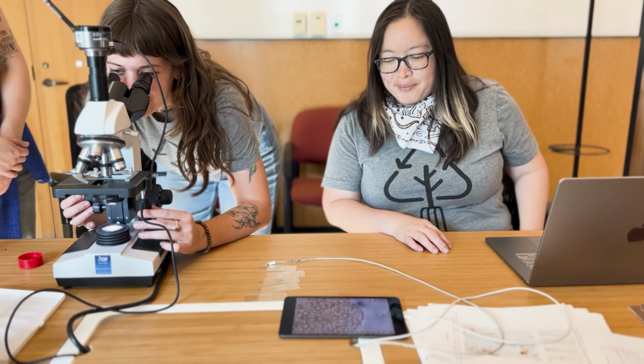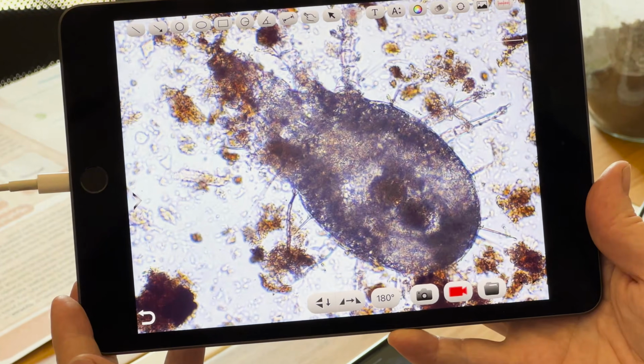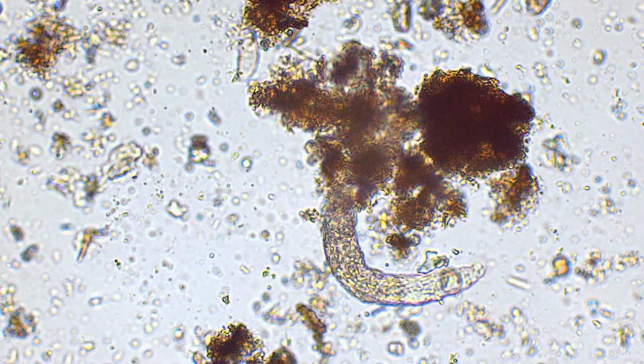LA Compost is a nonprofit that works to provide composting access and education across Los Angeles County. When we aren't composting or collecting food scraps at a local farmer's market, you can often find us at the microscope, educating community members about the benefits of composting and how decomposers influence soil and planet health. In this video, we will provide a quick how-to on getting started with soil microscopy so that you can learn about the microbes in your soil and the ecological benefits they'll provide to your community.